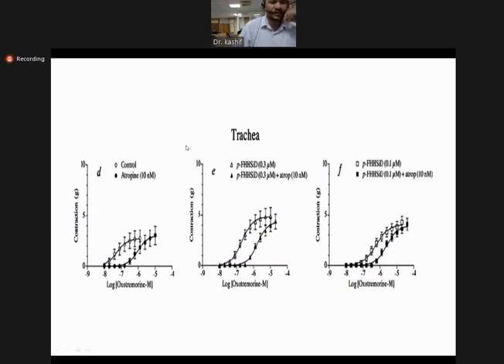Can you show the link? Yes, I described the link in the slides. I can show you again. Otherwise, you can just go to YouTube and search Power Lab. This is the first video that you will find. It's very easy. You go through here, you can see it's very clear. Otherwise, I will show you the link after these different questions. It's present in the slide.